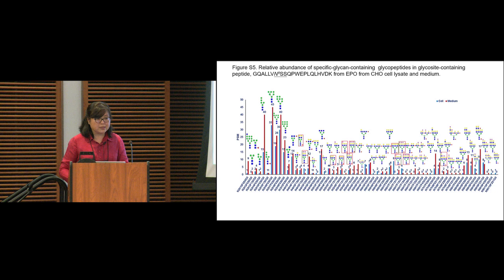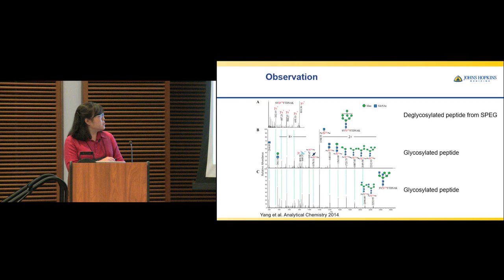We quickly realized that this glycomic approach has its own limitation. Since the glycan is released from the protein, we lost the source of where the glycan came from. In many cases, when we investigate antibodies or even very specific proteins, rarely can we receive highly purified proteins. So the glycan analyzed this way came from a mixture of glycoproteins. From this observation, we further investigated whether we can investigate the glycosylation at specific glycosylation sites. This paper is our first attempt to identify the glycan on a specific protein.